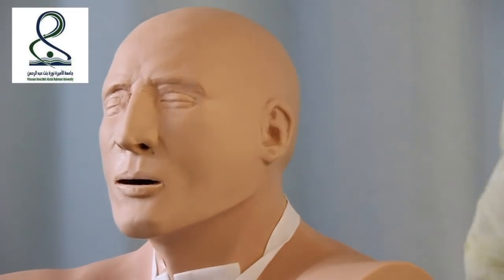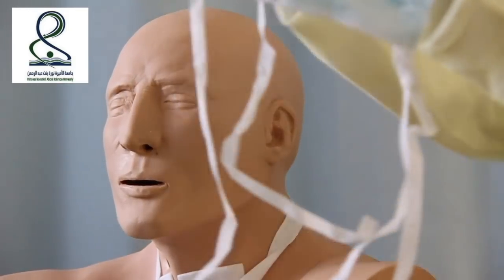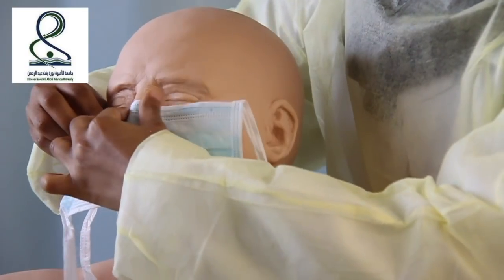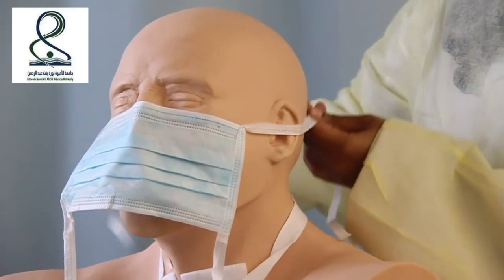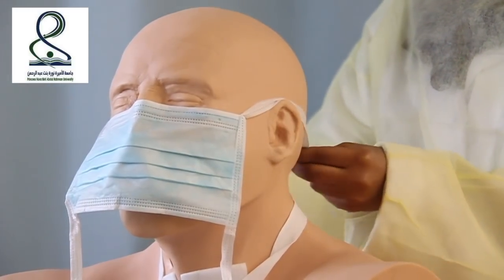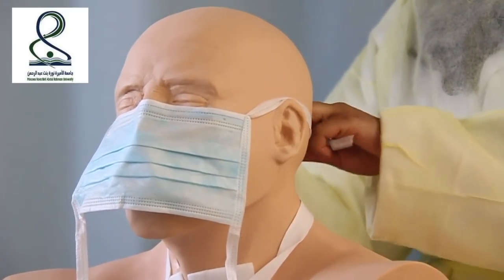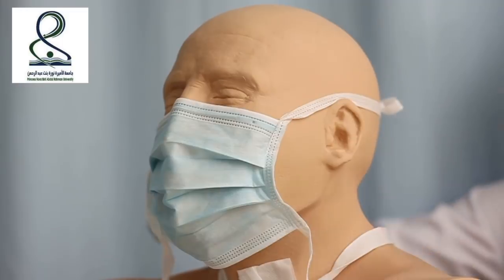Make sure the gown covers all your back, and then tie it from the back to the front. After wearing the gown, we wear the mask. We adjust the mask size to the nose and then tie the upper part of the mask. Then tie the lower part.